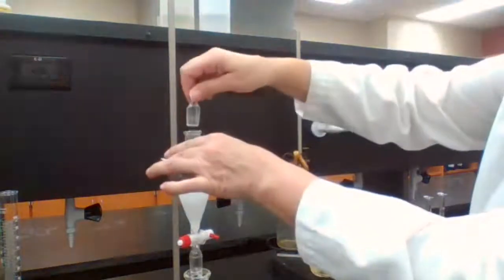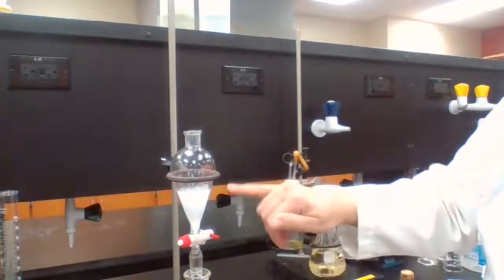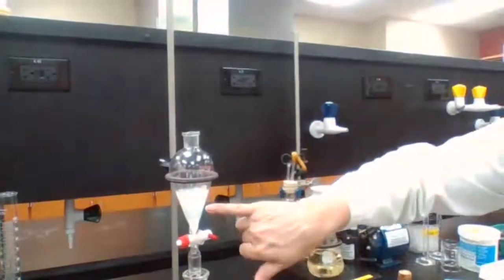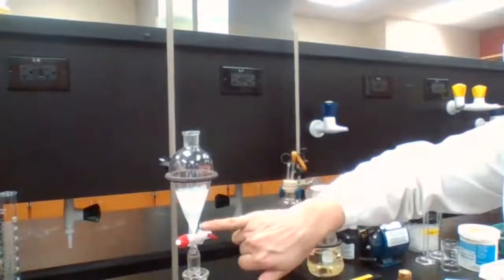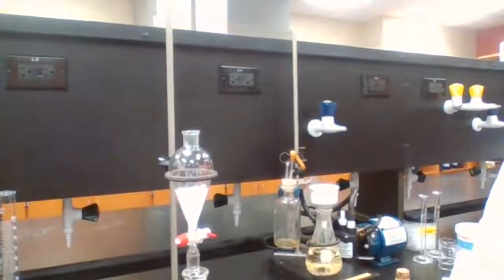I don't want to add too much of the sodium chloride because the layers have formed. Also, if I put too much, it gets saturated, it's not going to dissolve, and then it would be hard to remove the bottom layer.